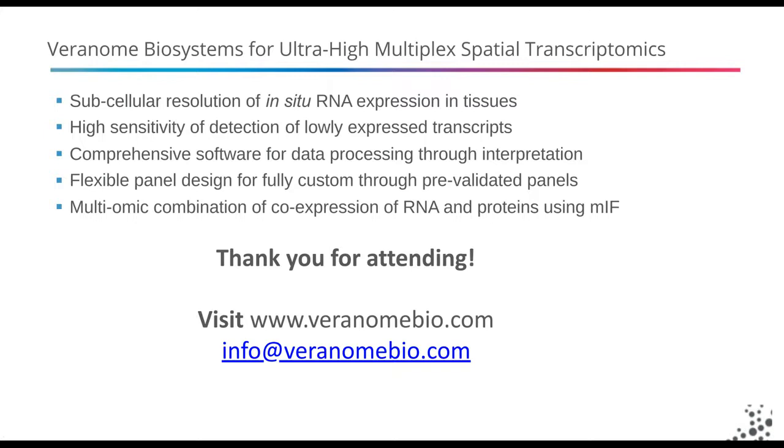Thank you, Chris. I believe this question is going to go to Brian. Can you describe the time it takes to go from image generation to data analysis? Yeah, sure. There are two stages really to get analysis-ready data. The first is to take a reasonably sized region of interest, say hippocampus and thalamus, and perform calibration, registration, and decoding, plus the cell segmentation. All those pre-processing steps take probably somewhere in the range of 1 to 3 hours.